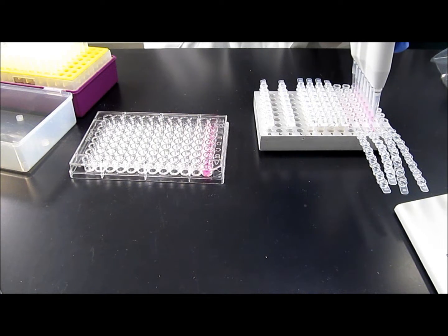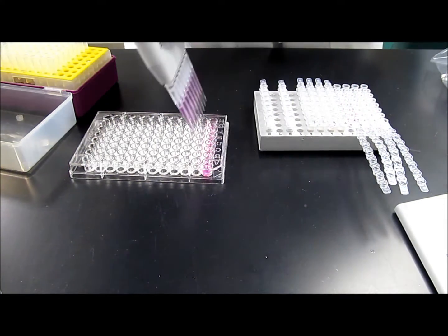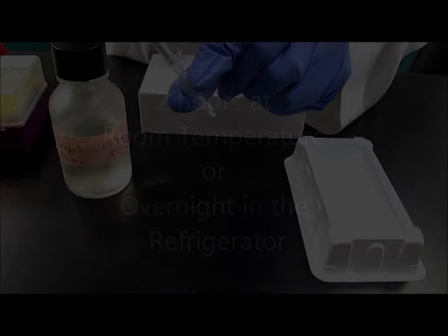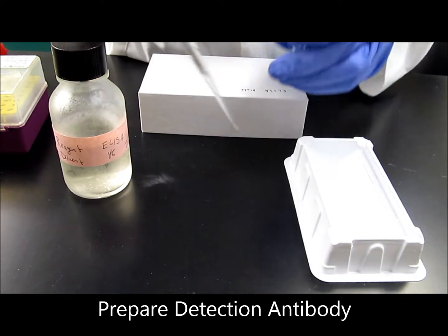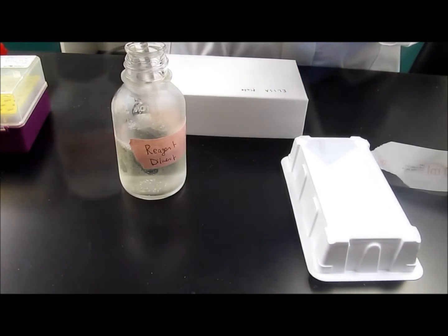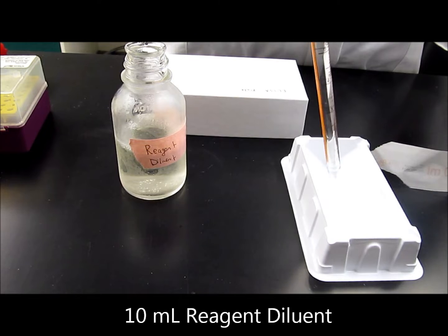At this point you have added your samples to the ELISA plate and have incubated them for 2 hours at room temperature or overnight in the refrigerator. Now you will want to prepare the detection antibody by diluting the correct amount of it in 10 milliliters of reagent dilutant.